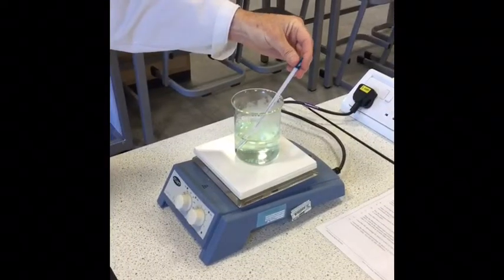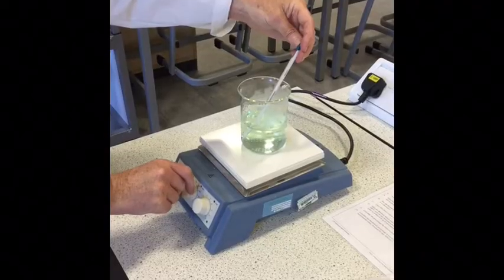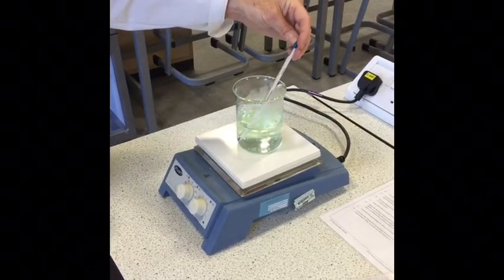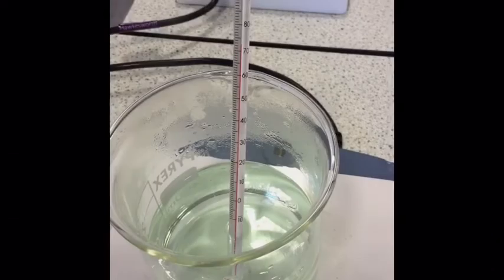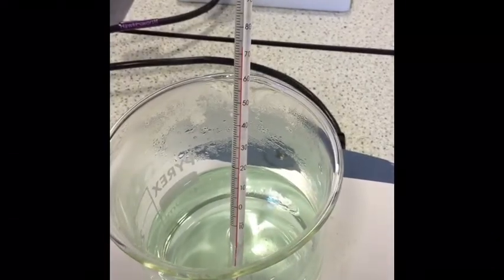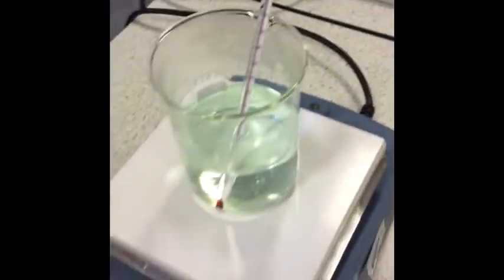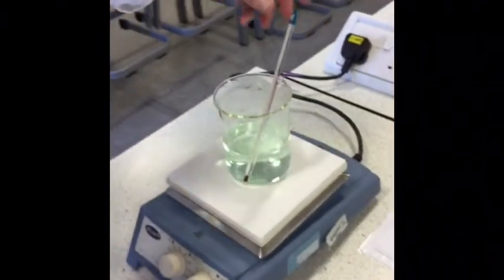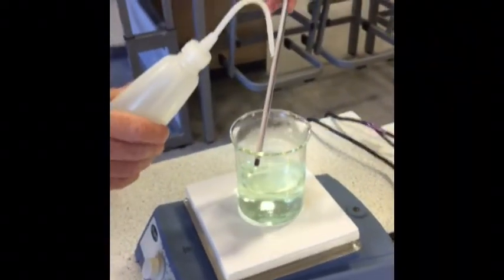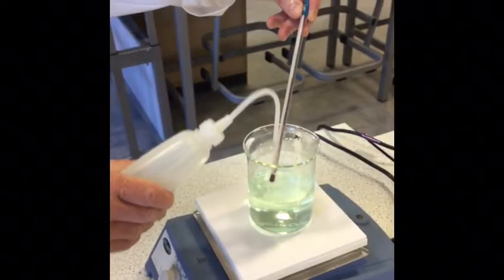Okay, so that's at around about 50 at the moment, so I'm just going to turn down the heat so it starts to go up a bit more slowly now. Okay. Right, so we've got a temperature now in between 70 or 80 degrees, so we'll turn off the hot plate, take the thermometer out, and in fact, to stop losing some of our nickel, we'll wash down the thermometer when we take it out.